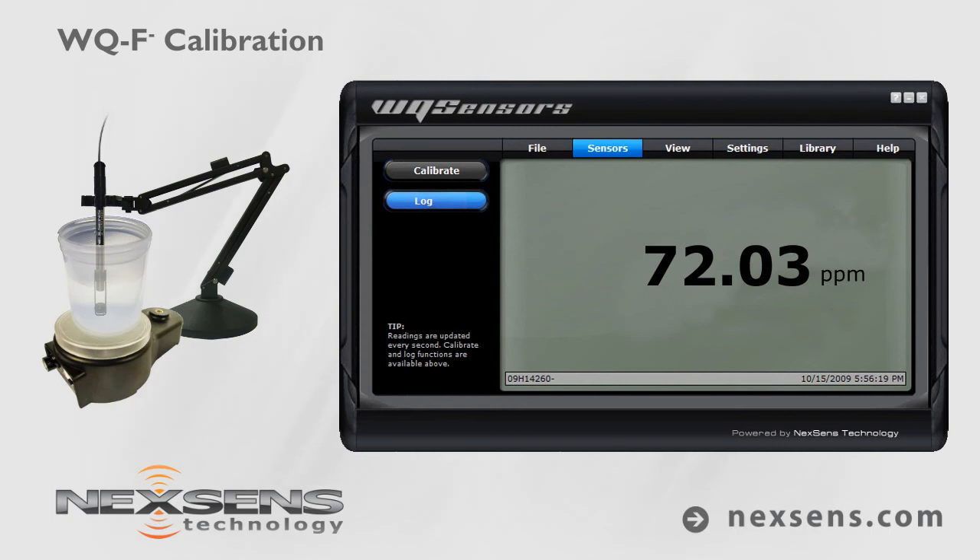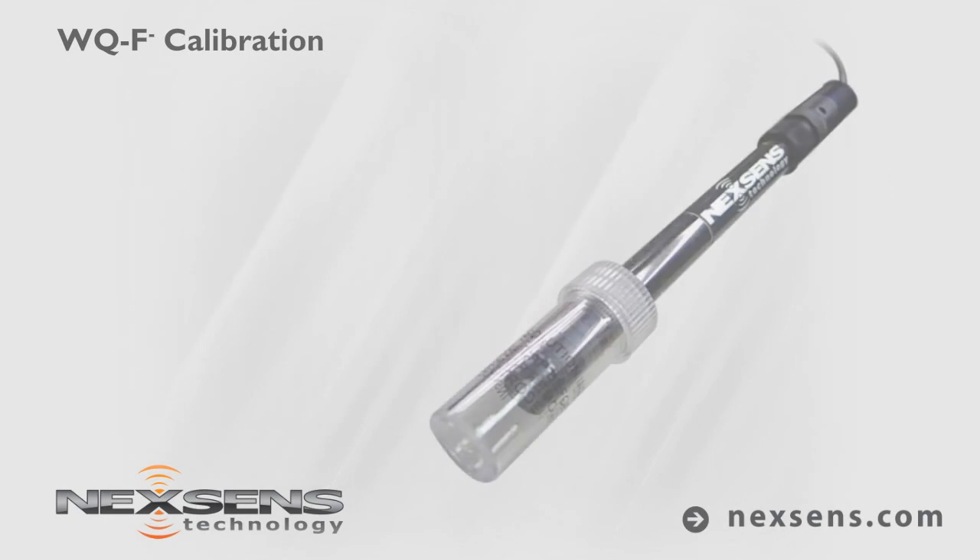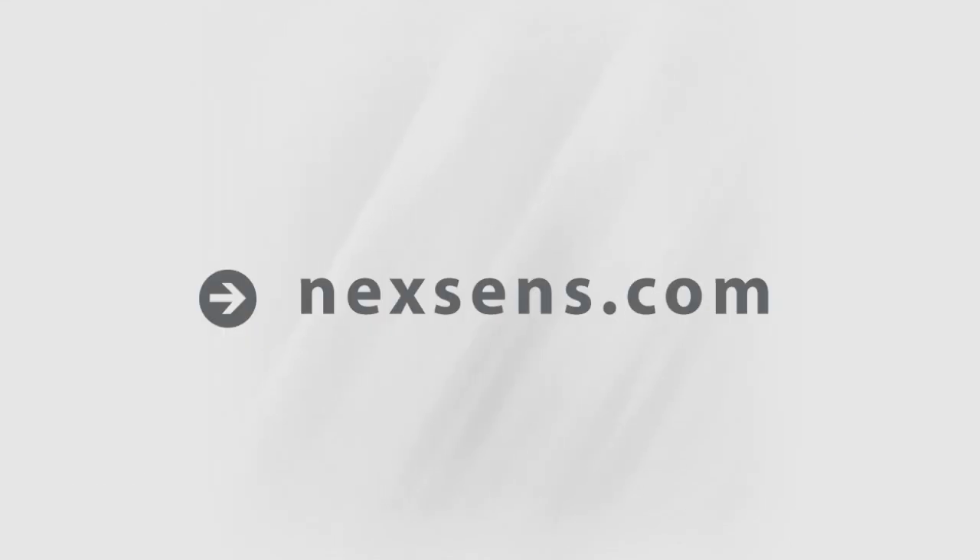Quality data collection requires frequent calibration. For best results, calibrate before each use. When not in use, the WQ Fluoride sensor should be stored in the bottle in which it was shipped. NexSense WQ Sensors — the latest in smart sensor technology.